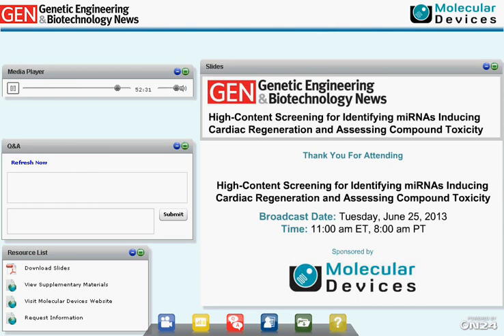Have you used the contracting cardiomyocyte assay to look at a larger set of compounds? Yeah, we actually tested a commercially available small library, the ScreenWell library from Enzo Life Sciences. It has 131 different compounds. 107 compounds are different types of cardiotoxicity, and then there are 24 control non-toxic substances. We ran that on our system, and actually we saw fairly nice results. We were getting predictivities of almost 90% when using multiple parameters out of the assays. So very, very encouraging results given a small set of compounds.